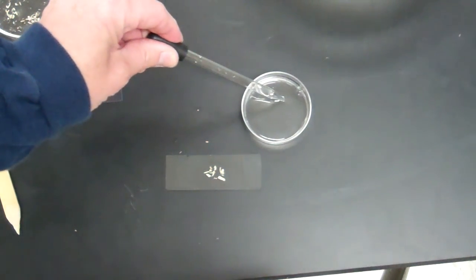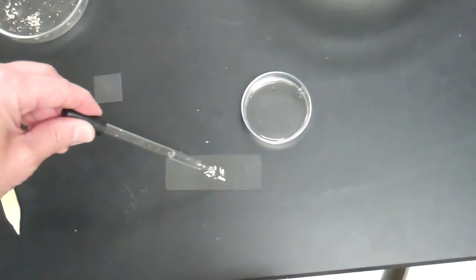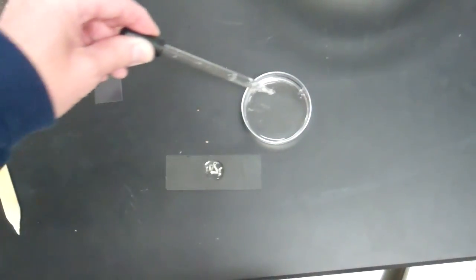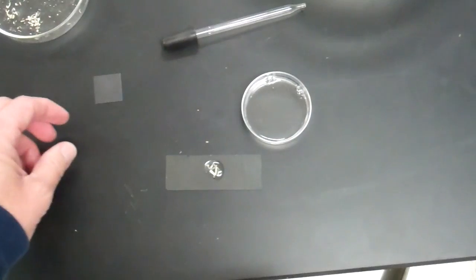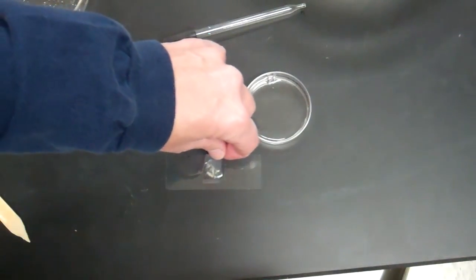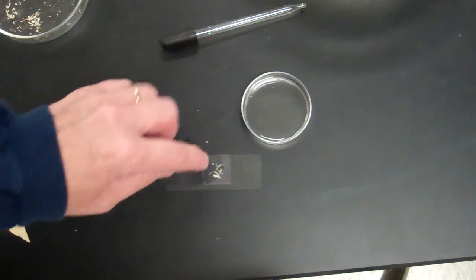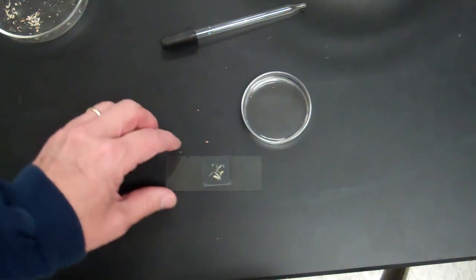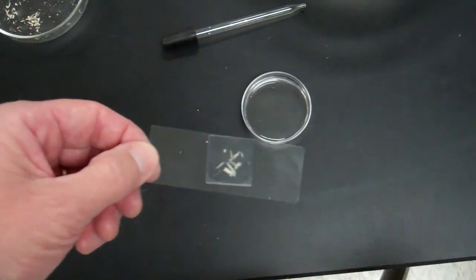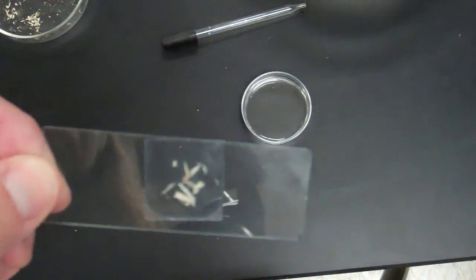Take some water from your water dish and put a few drops on it, about the size of a dime. Angle your cover slip at a 45-degree angle, let it fall, tap it down a little bit to get those air bubbles out. And here's my slide.